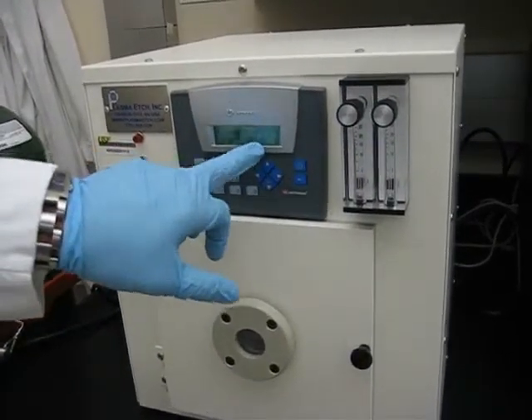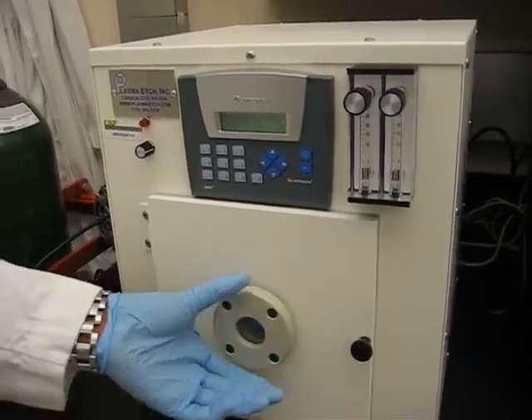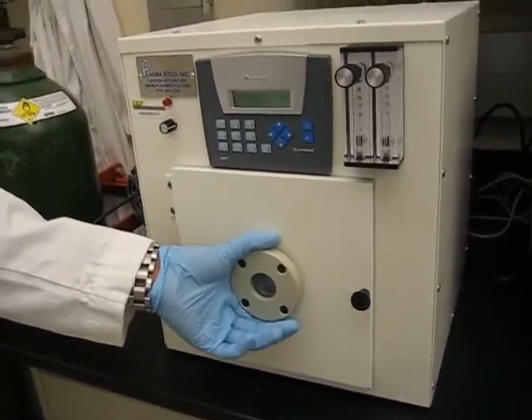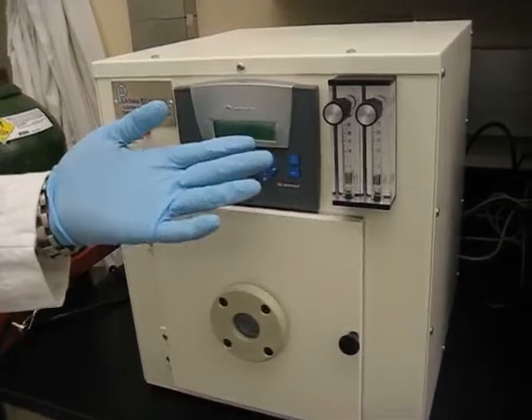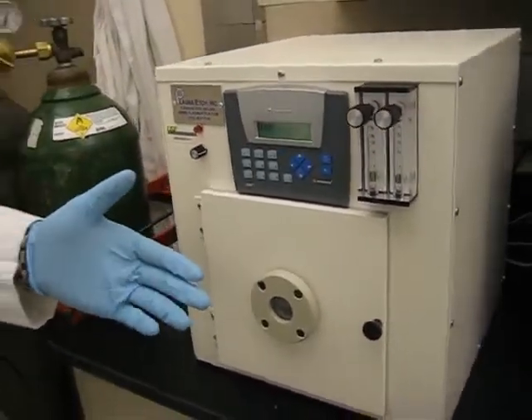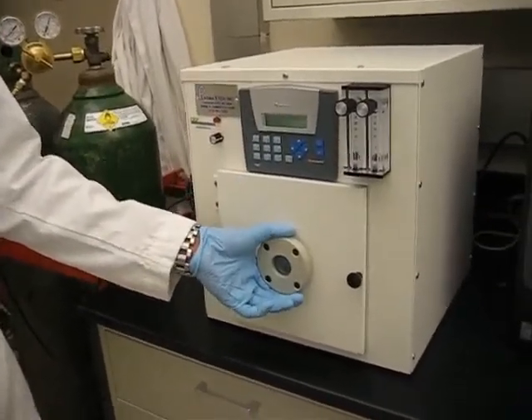Now you can see it's pumping down pretty fast. The pump-down time depends on how clean the samples are. If the samples are sonicated first in 70% ethanol, it doesn't take too long to pump down. But if they're not clean and have particles on them, it takes longer — you get a lot of outgassing.